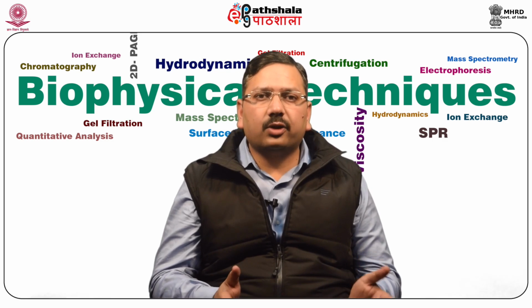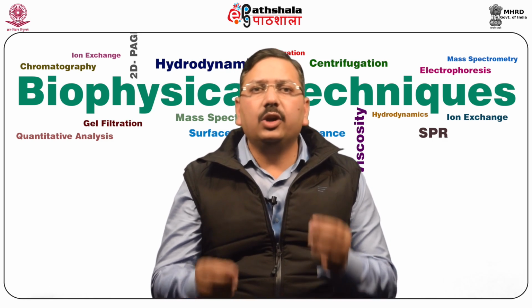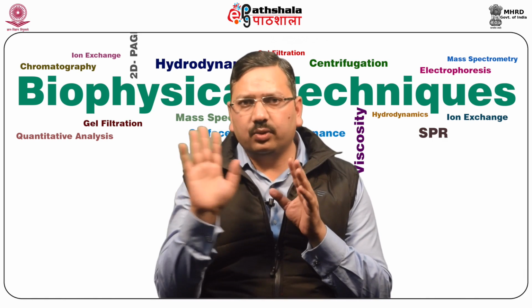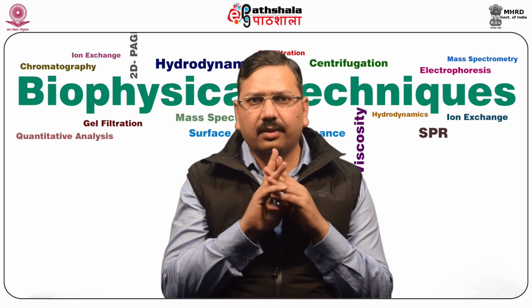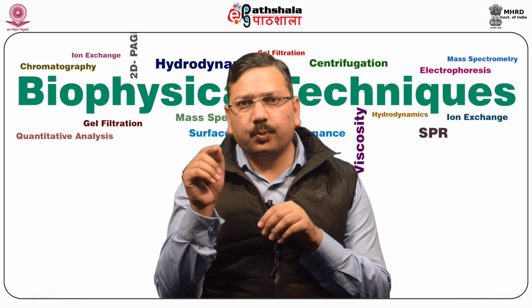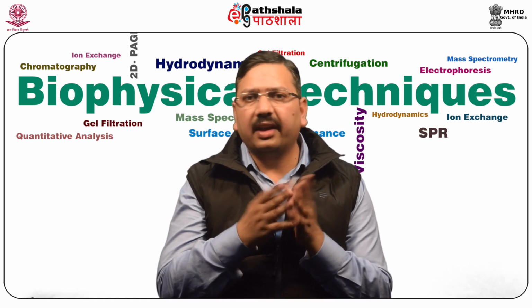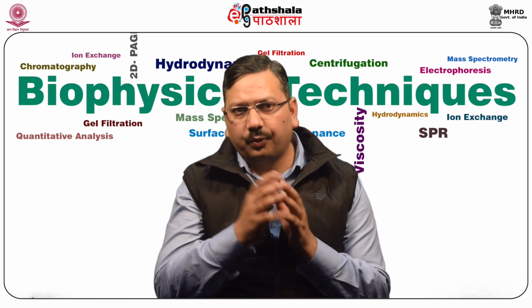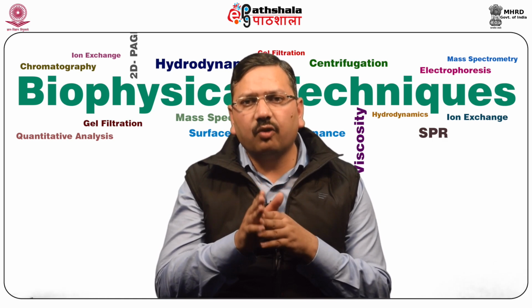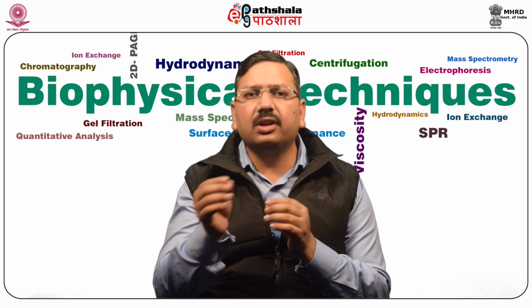Now, for mass spectrometry, the first thing is how to introduce a sample into the mass spectrometer. A pure sample can be inserted directly into the ionization source. That can be done. But what about a complex mixture? Complex mixtures are first processed through various chromatographic techniques like HPLC, gas chromatography, or capillary electrophoresis. After separation by these technologies, a series of components can then be entered into the mass spectrometer sequentially for individual analysis.